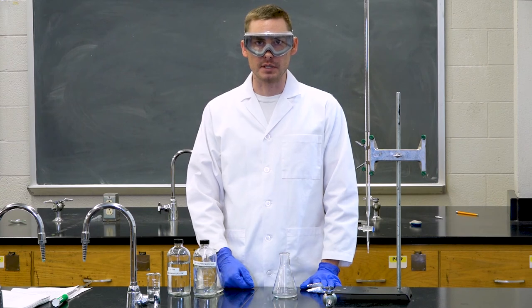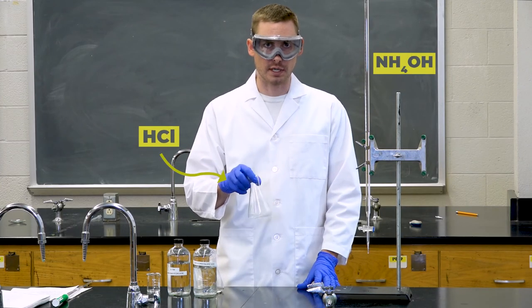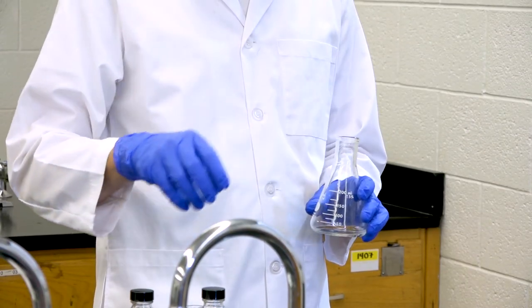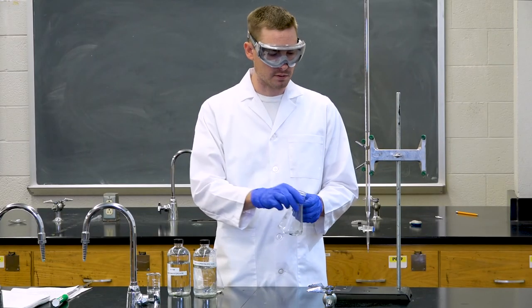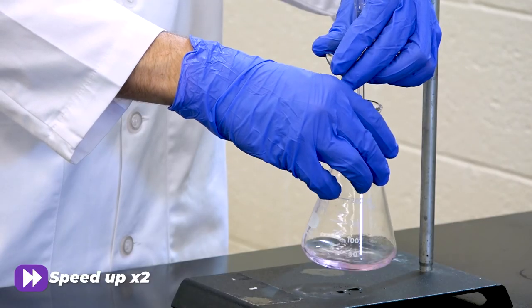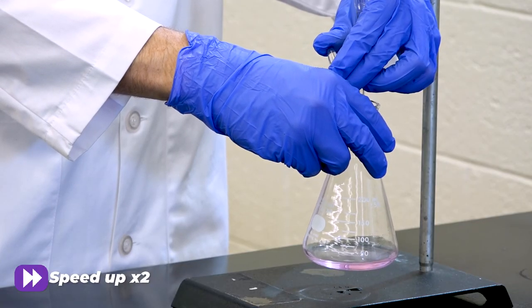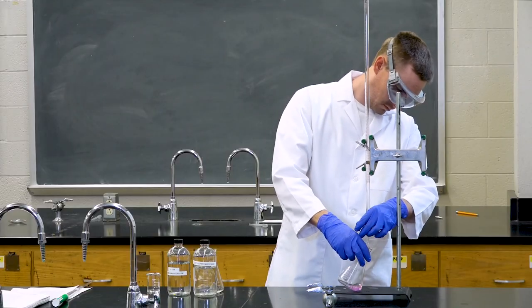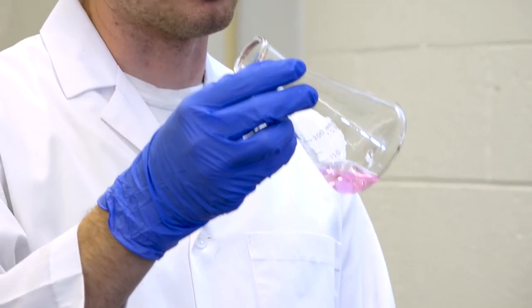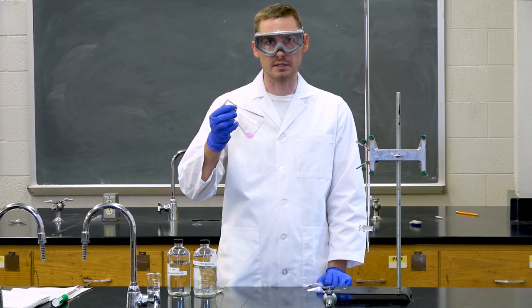And for the last experiment, we'll be doing the same titration, but this time we'll be using ammonium hydroxide in our burette and hydrochloric acid in our flask. I have already added the 10 milliliters of hydrochloric acid and the phenolphthalein indicator, so we can now start our titration. Once you have reached a faint pink color, you are at the end point of your titration, and you can record the final volume on your burette and then proceed to do the calculations.